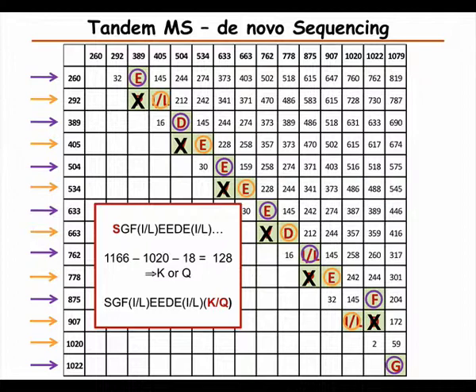And this is the case when you don't have a database; this is what you have to do. There is some software out there that can do this or can help you with it, but it's really far from perfect. And it's still a problematic case when you don't have a good database.